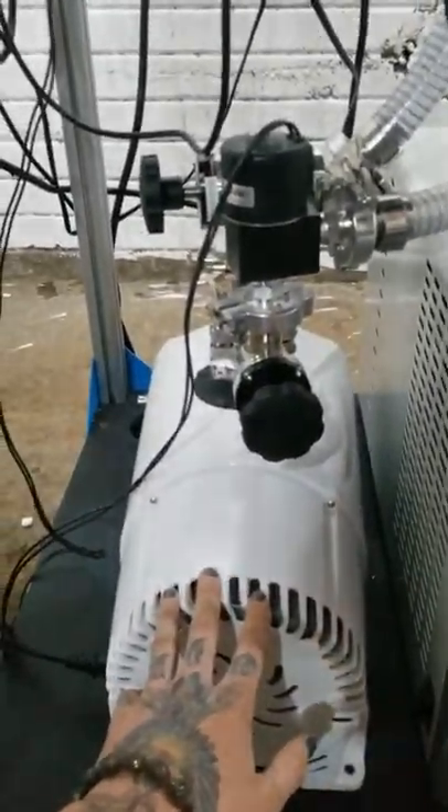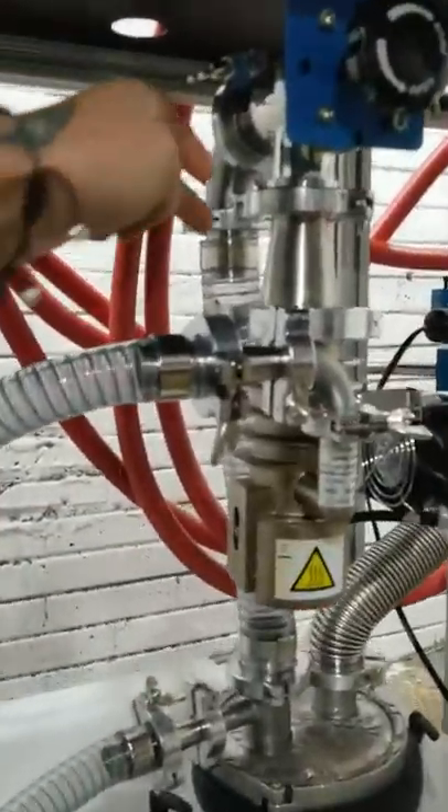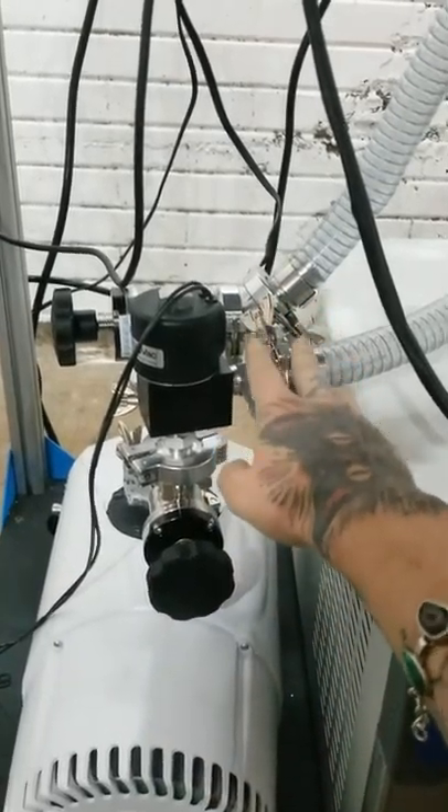We have a scroll pump here — it's an Agilent IDP7. And then we have the diffusion pump right here, this component on down. We're going to go over how to operate it. You have two sets of valves. This valve is the roughing valve.